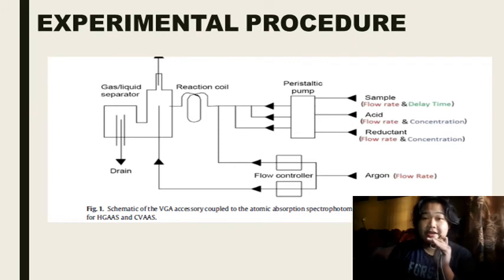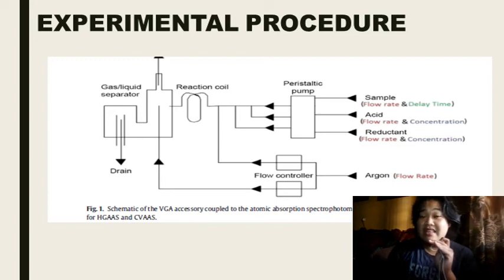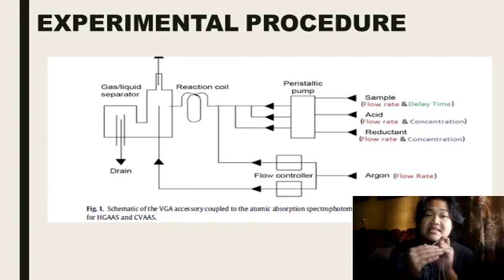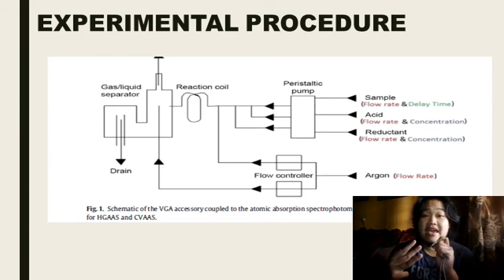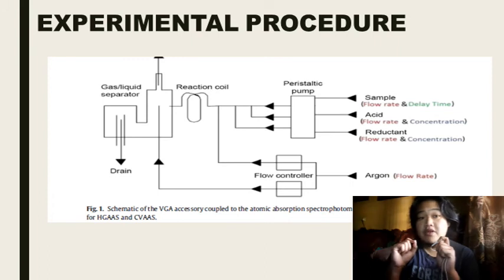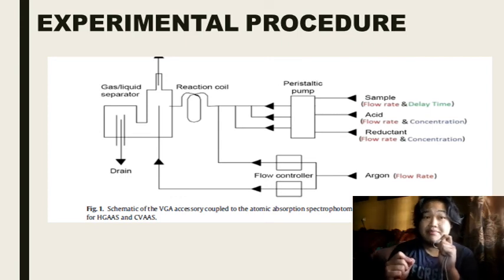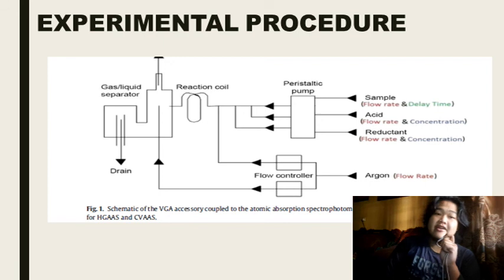determined by the flow rate. Number 6, adjustment knob either tighten or release. Number 7, the deionized water pumped through the entire system for 60 seconds while being analyzed. Number 8, varying the pump tubing internal diameter. Number 9, absorbance for sample were recorded at each change in flow rate of acetylene gas and argon.